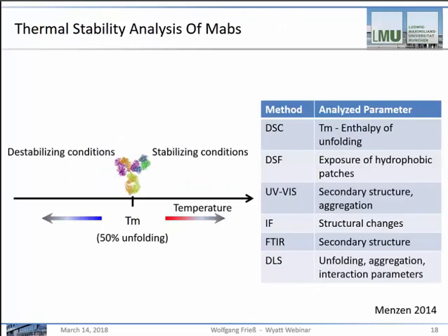Now expanding on this, with these temperature-dependent studies, DLS can become a complementary method, beyond colloidal stability studies, to typical temperature ramp methods like DSC or DSF. It can also be supported by temperature-ramped UV-Vis, fluorescence, or IR studies.